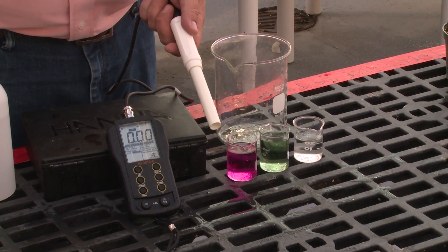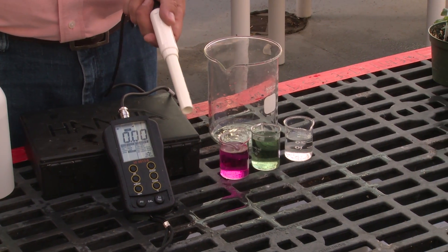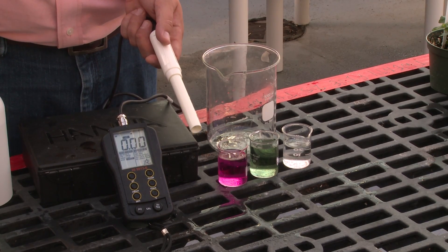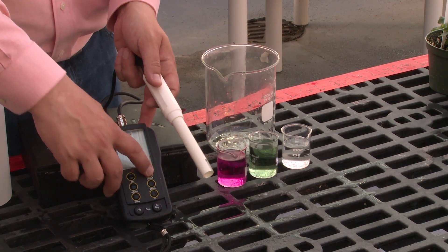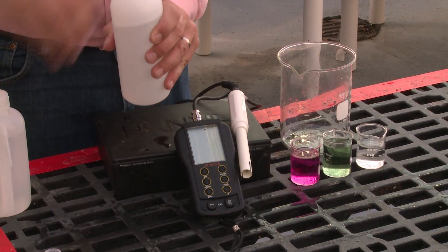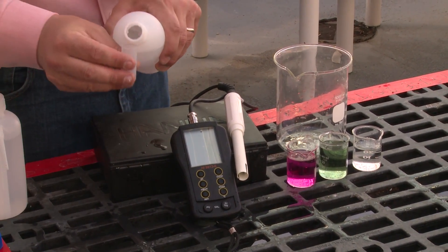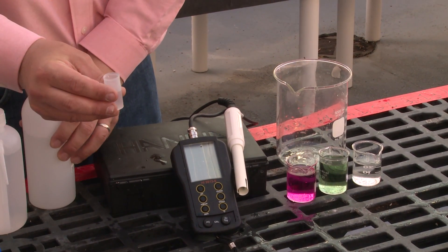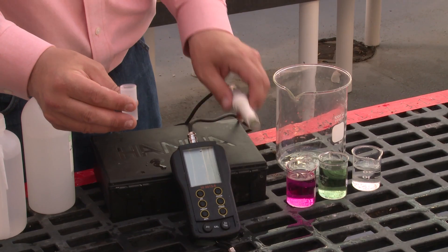Now we have a calibrated pH and EC meter. In order to keep your instrument in good working condition, when you're done using the meter, remember to turn it off. Take some of your reference solution and refill the amount in the cap. Again, we want to make sure that the probe is submerged in the storage solution. This video is focused on how to calibrate your pH and EC probe to get the best readings.